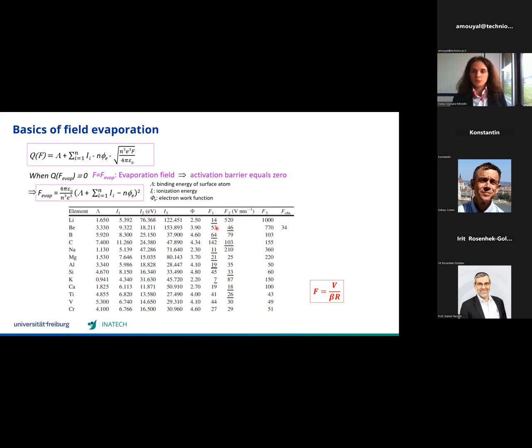The difference between the single charge ion and the double charge ion is not that much. So we most probably see both charge states in the mass spectrum, and the one which prevails would even be the double charge ion. So we know exactly from the theory what we should expect from the mass spectra, and in which proportion.